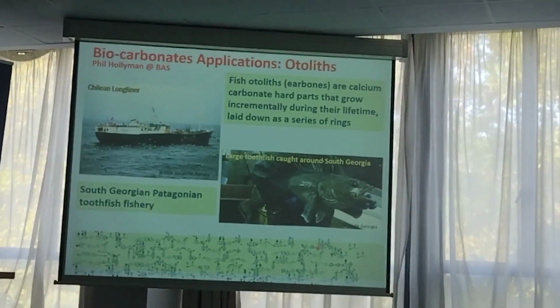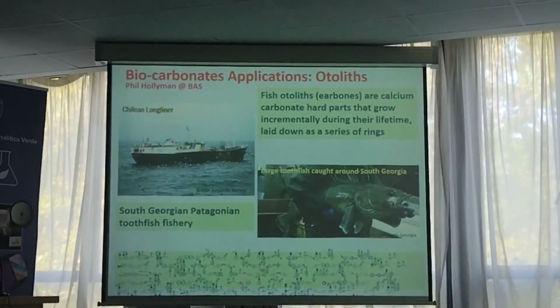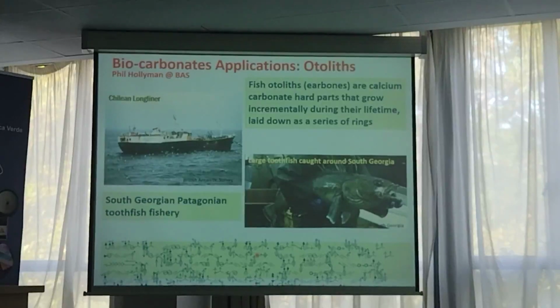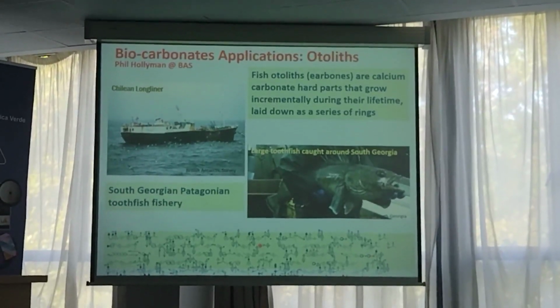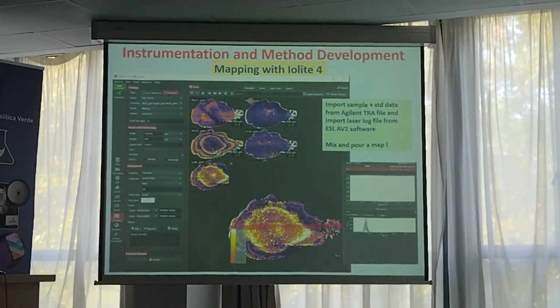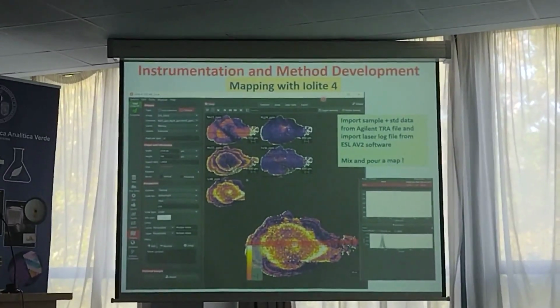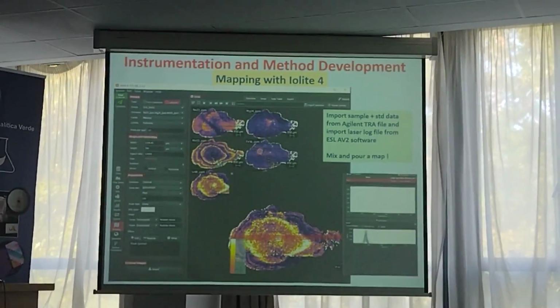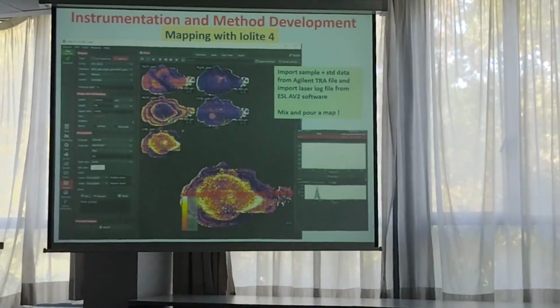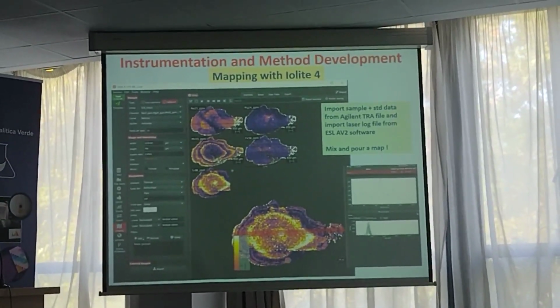What's interesting, this is not pretty. There's supposed to be some text here, but for some reason it's not quite right. Anyway, he's been collecting the otoliths and looking at these, and we have been making maps of them. This should have been a demonstration of why we use this software I like for working with laser ablation. We've spent 2 days with problems with it, but actually when it works, it works very well.